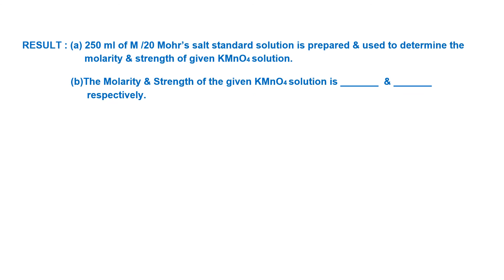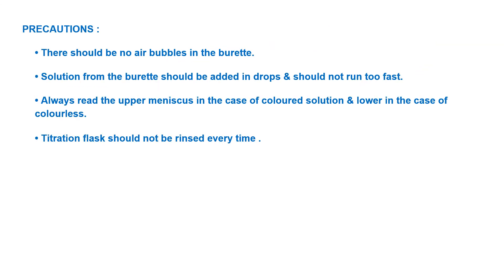For the result: Part A — 250 ml of M/20 Mohr salt standard solution is prepared and used to determine the molarity and strength of the given KMnO4 solution. Part B — the calculated molarity and strength of KMnO4 solution are to be filled in. Precautions: ensure no air bubbles in the burette — if noticed, run the solution to remove them. Add solution from the burette in drops, not too fast. Always read the upper meniscus for colored solutions and lower meniscus for colorless ones. The conical flask should not be rinsed every time, as residual water may dilute the solution and prevent concordant readings.